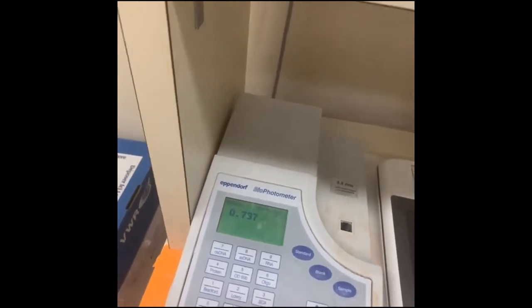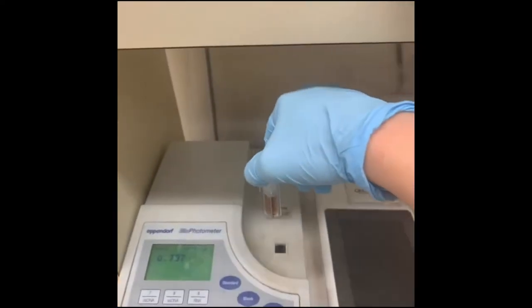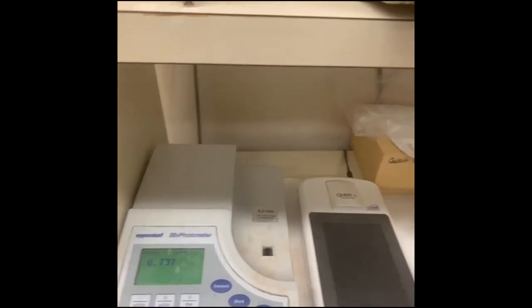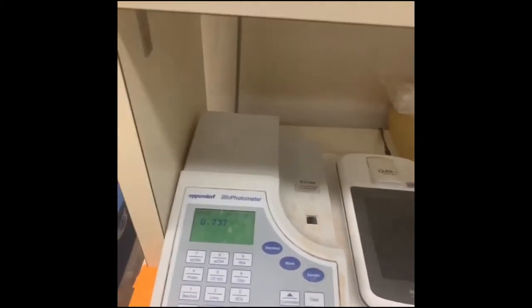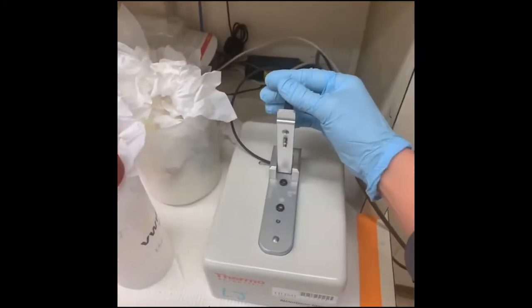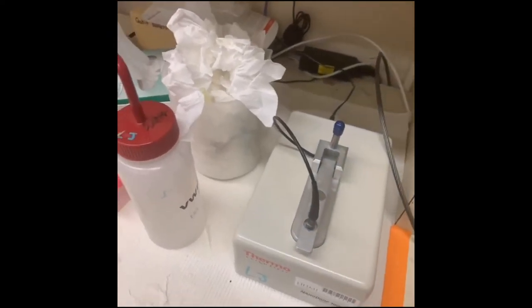This is a spectrophotometer — basically you stick your little cuvette in here and it measures how much light goes through at different wavelengths. That can tell you protein concentrations using methods like Bradford, or if you're working with bacterial cells, how much they've grown. This is a nanodrop, which is a similar type of thing but it uses a tiny little drop so you don't use as much sample.